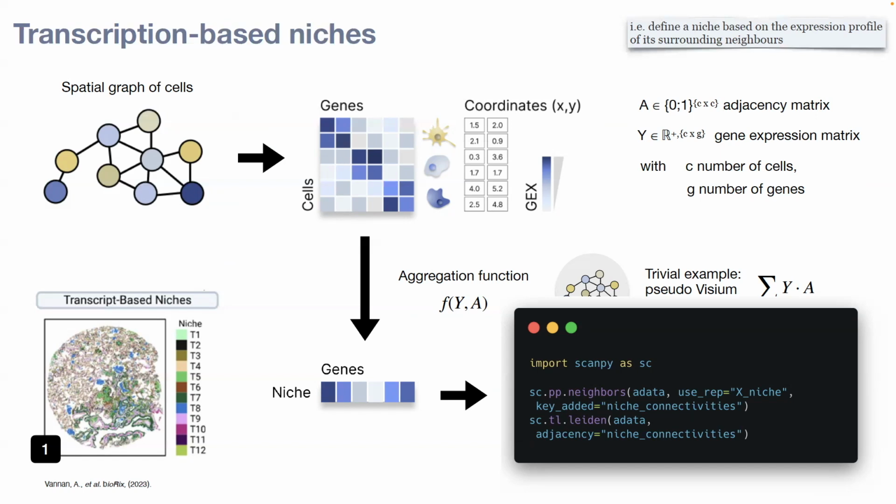The reason, from a math perspective, working on graphs, because I have been working with graphs for a long time, is that typically your own representation is a quite heavy confounder for your representation, which you don't necessarily want when you, for example, look at cell-cell communication in space. You don't want to boil down to a cell type again. So you try to remove confounding information in your analysis.